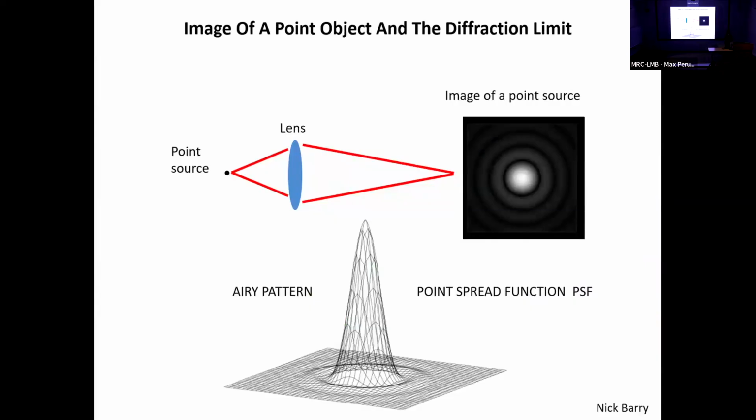So in the confocal microscope, we are back to point sources, imaged as point sources. So now we're really seeing the diffraction effect. We have a point-like object. Its image is a diffraction pattern, which, where height is intensity, is something like this. This is known as the Airy pattern, or otherwise known as a point spread function. And this is the thing that has extent. So we can have a very small object, but the image of the object is a few hundred nanometers across, as determined by Abbe's formula.